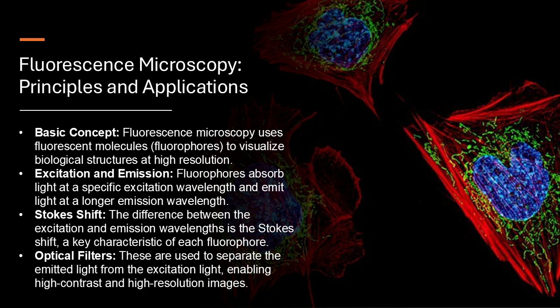Absolutely. And the whole process is governed by the laws of quantum mechanics, which adds another layer of complexity. You see, a fluorophore's lifetime, how long it stays excited, and its quantum yield, how efficiently it emits light, determine how bright and long-lasting its glow will be. So we're dealing with some pretty fundamental physics here. But how does this all translate into building a microscope that can actually capture these tiny flashes of light?